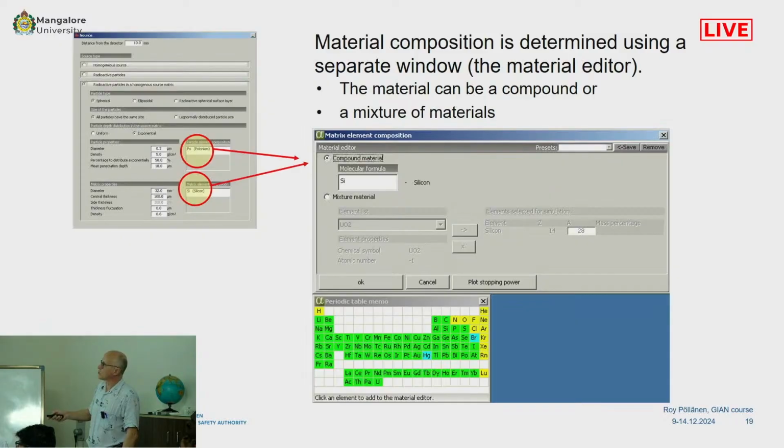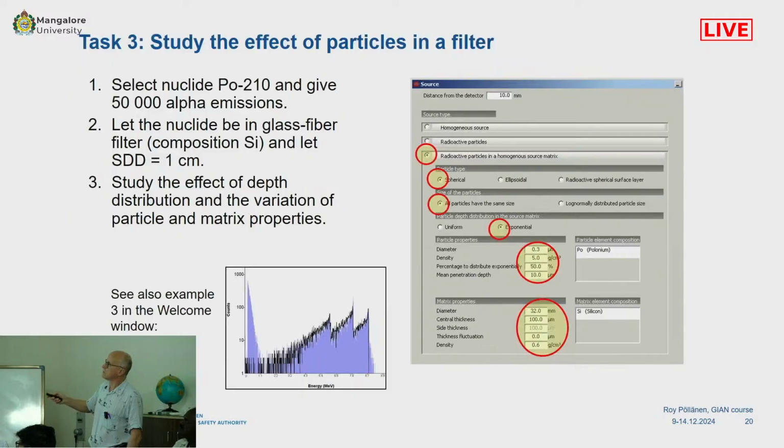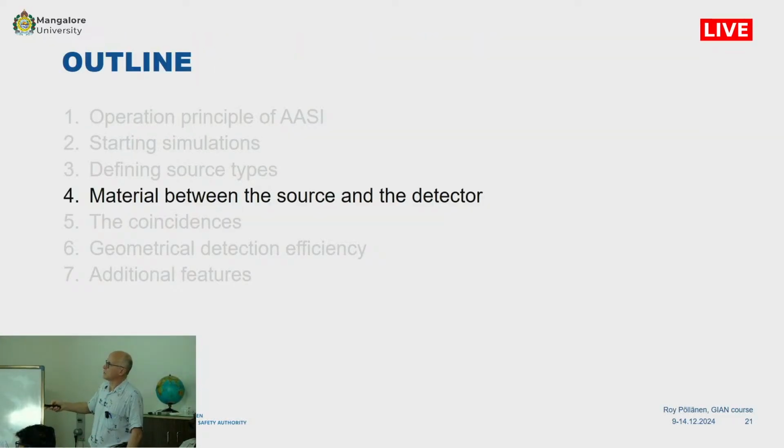Material composition. I cannot show it just now, but it can be done easily. Effect of particles in a filter. Material between the source and the detector.